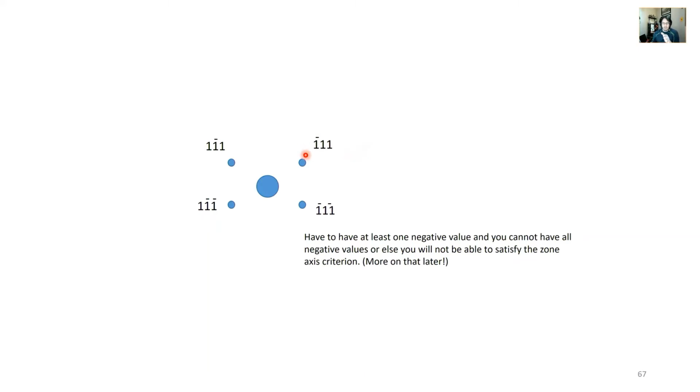And so I decided just to assign this one as 1, negative 1, 1, 1. So it's a little arbitrary, I know. I was going counterclockwise, and so instead of having the first one be negative, I made the second one negative and then the third one positive, so I was only assigning one negative number. The rest of these spots are identified by symmetry. Again, this is a little arbitrary, and I don't want people to be confused, but I made these crosswise spots the opposite of these. Okay, so I arbitrarily picked negative 1, 1, 1 to be this first spot.